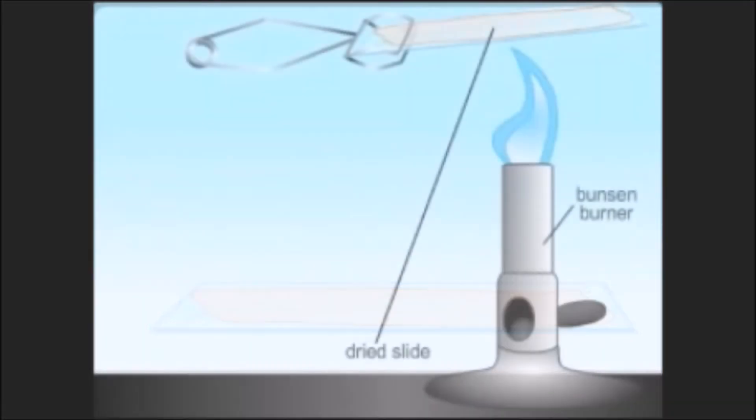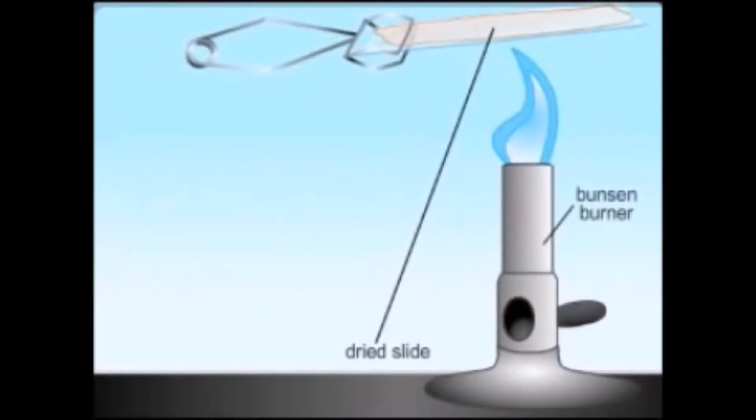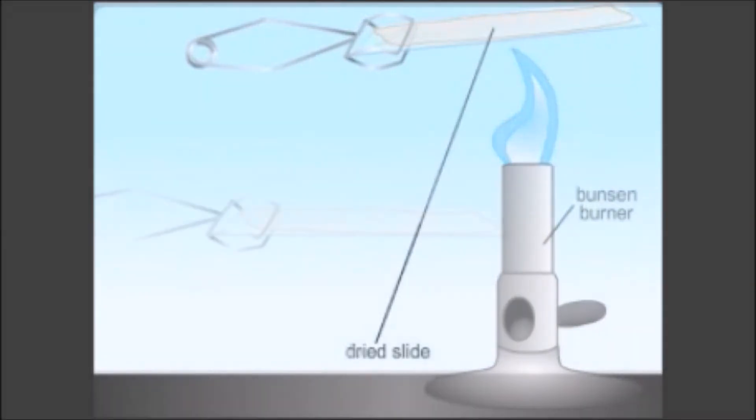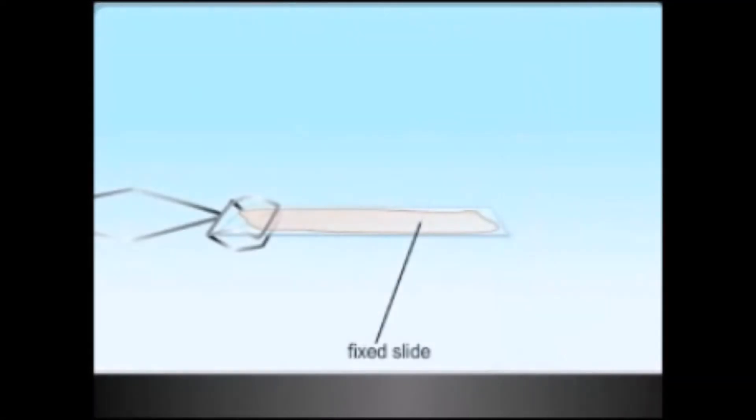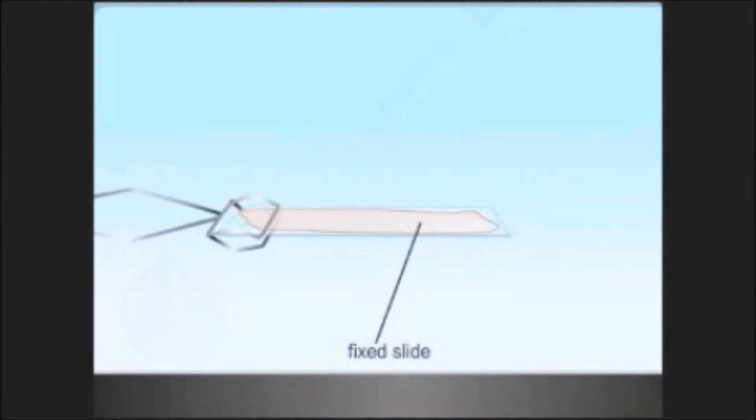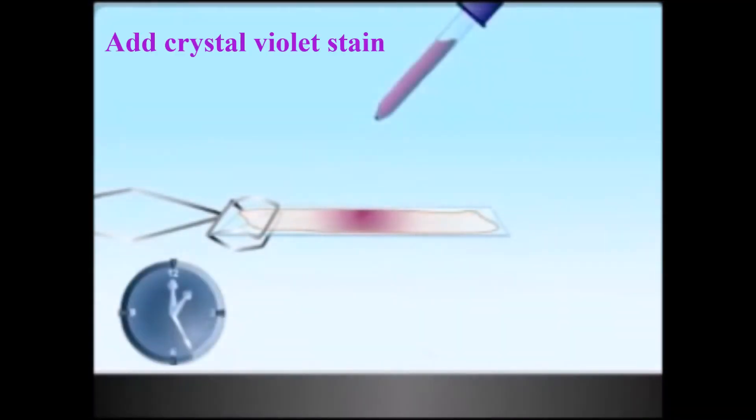Air dry the culture and fix it over a gentle flame while moving the slide in a circular fashion to avoid localized overheating. The applied heat helps cell adhesion on the glass slide to make possible the subsequent rinsing of the smear with water without significant loss of the culture. Heat can also be applied to facilitate drying the smear. Add crystal violet stain over the fixed culture.